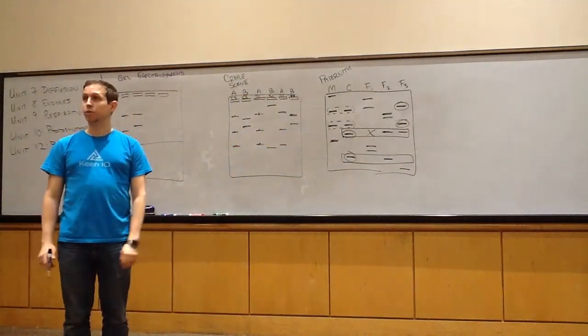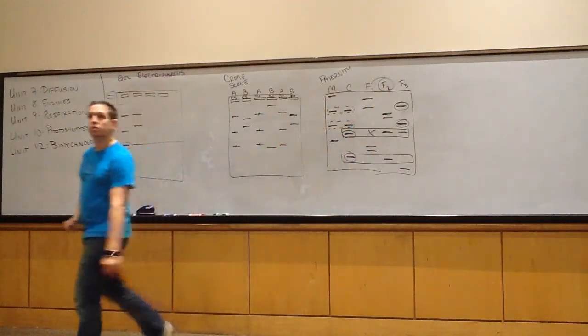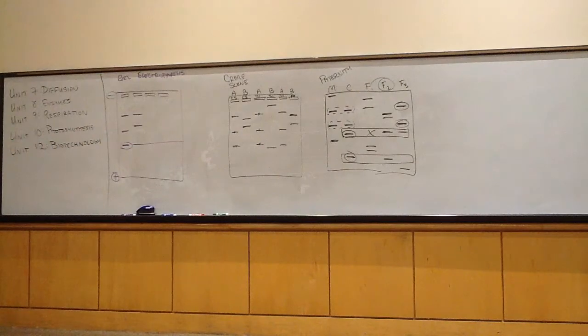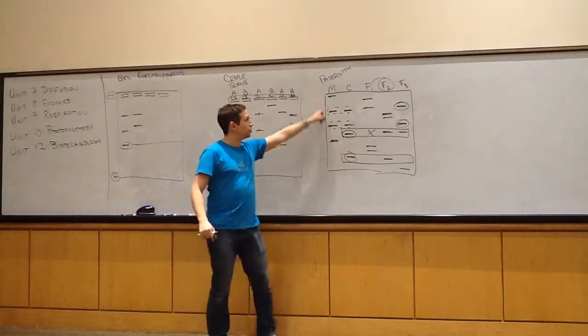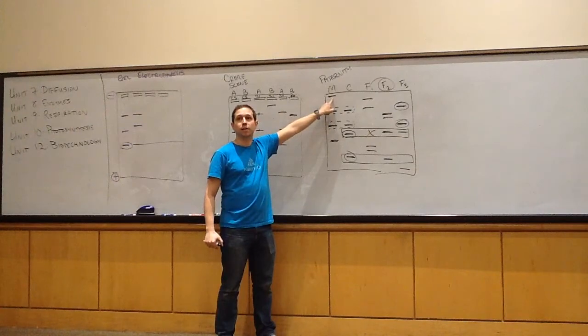And so we are able to. So in this case, it would be this individual. Questions, concerns? Shiv? Like, how do you know that the bands are shared? Like, why can't the bands share? They can't be shared. How else could this mother give birth to this child? Because this band doesn't match with anything in the child.